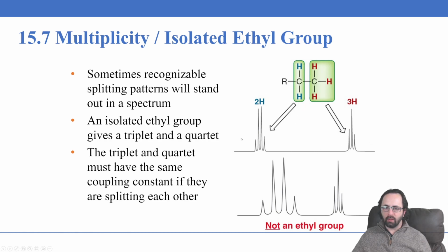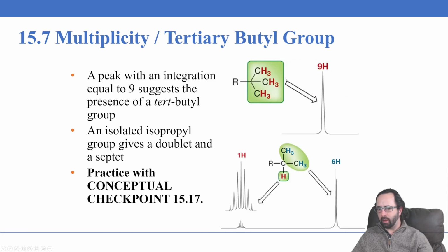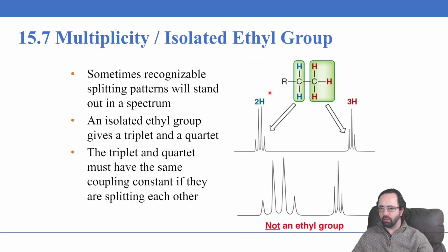So notice that this ethyl group has to be isolated. It has to be an isolated ethyl group. If it's got something else here, that will change things as well, right? Because this one will be split perhaps by these ones as well.